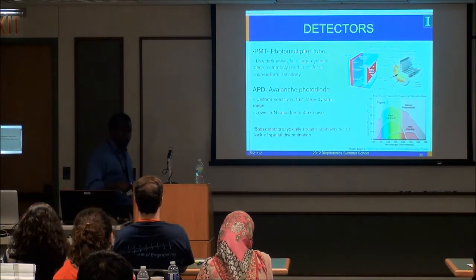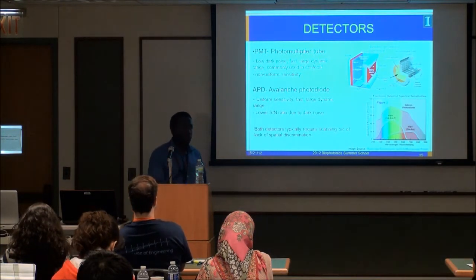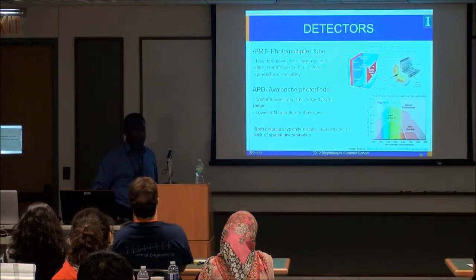So for some people who want to do live imaging, live fluorescence imaging, where you're moving fast enough that you have a limited integration time, they may prefer using a bank of PMTs rather than APDs in their microscopes.